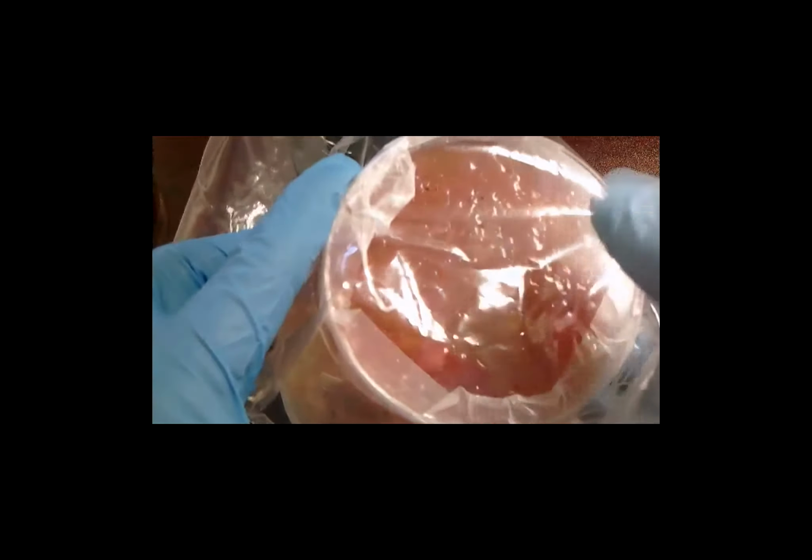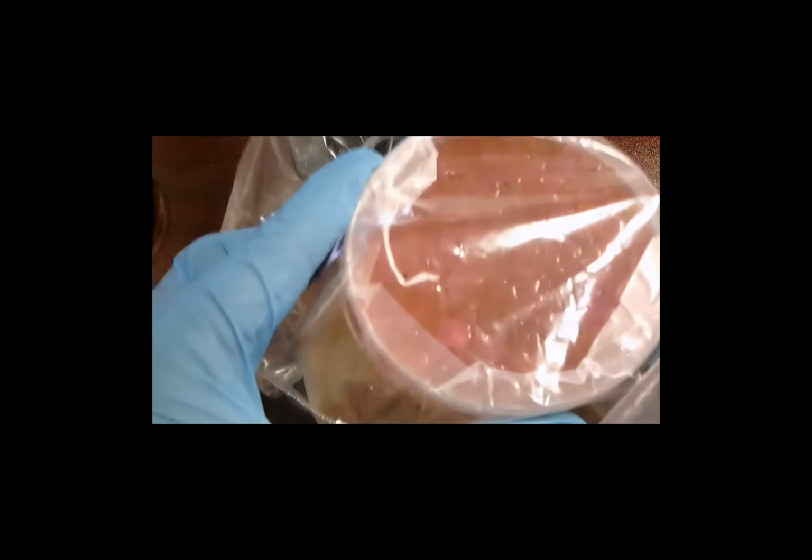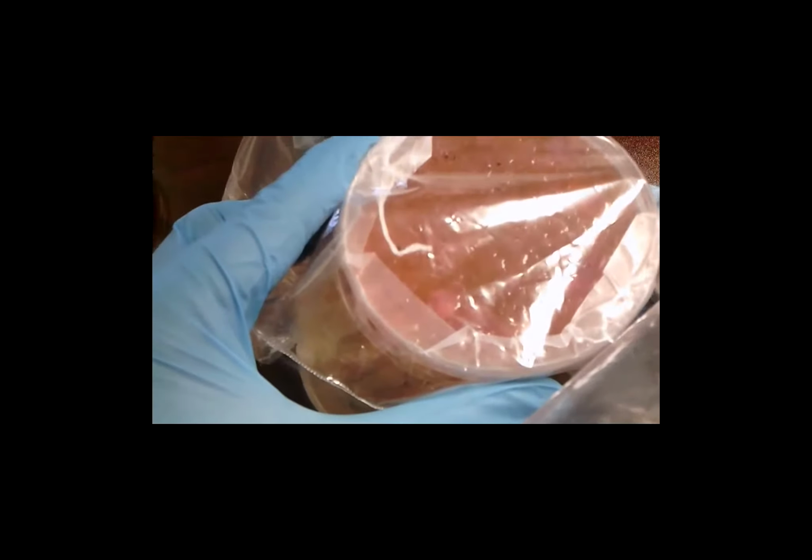Right now, on this plate, we would never use this on the contest. It was plated on December 3rd, and it's the 9th. So it's way too old, and it needs to be disregarded. But I wanted to show it as an example for you guys here today.